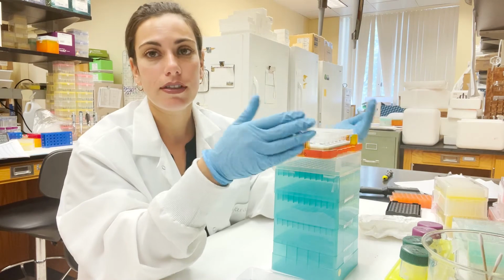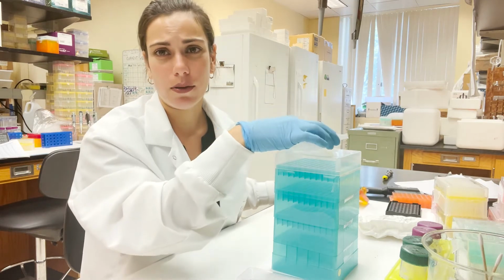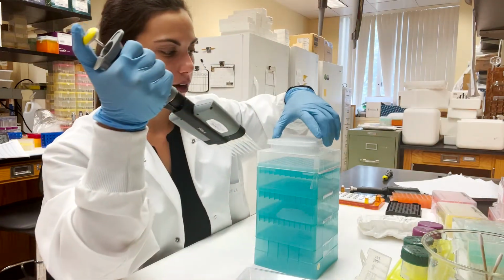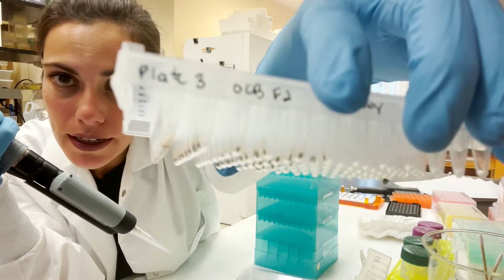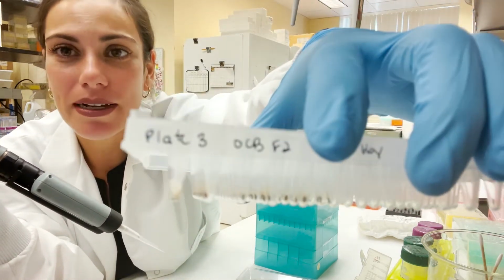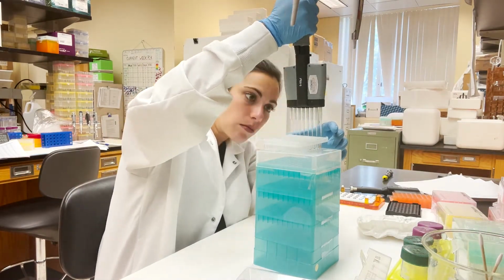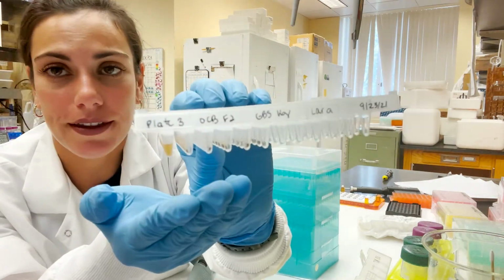I like to take the whole thing off the stand at this point, off the magnetic stand that is, because they're pretty stuck to the wall. And then I add, and this way it minimizes pipette tips. At first you can see it's flaky. Like, it's still mostly clear. Hopefully you can see that. It's mostly flaky and clear. You want to mix it until it returns to that mud-like consistency that we saw in the beginning. So that is, in the first row, a more appropriate consistency. And that means now that they're in solution.